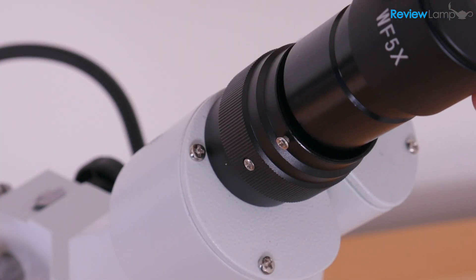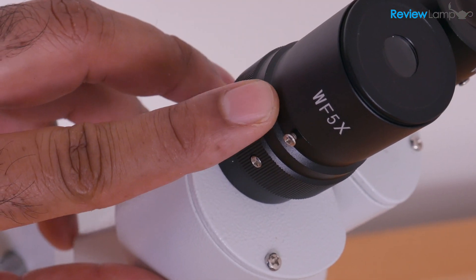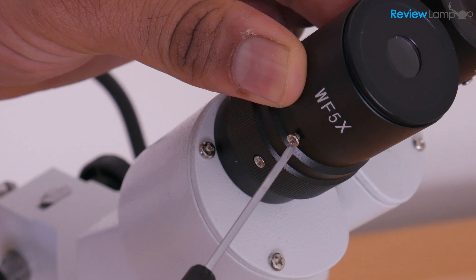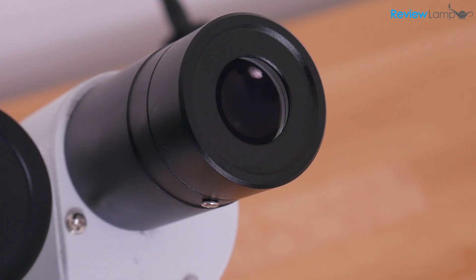And to install the 5x eyepiece, simply slot it in and make sure that it is flush with the receptacle. Then hold it in place, grab your screwdriver and tighten that screw back up. And we're going to repeat the same process for the other eyepiece as well.